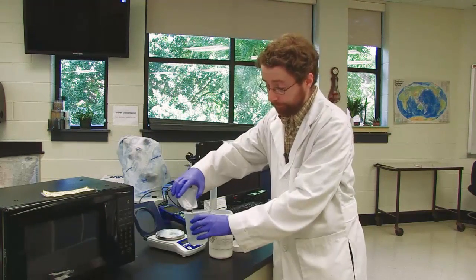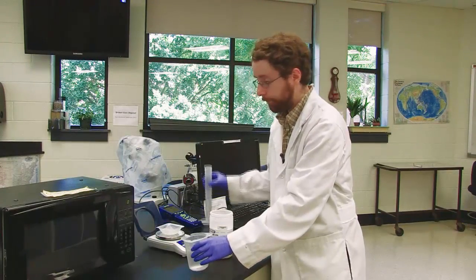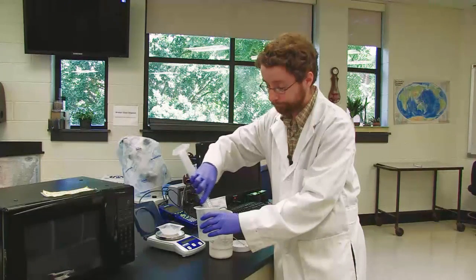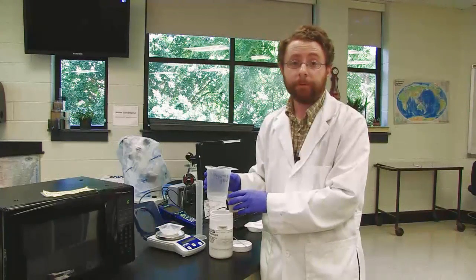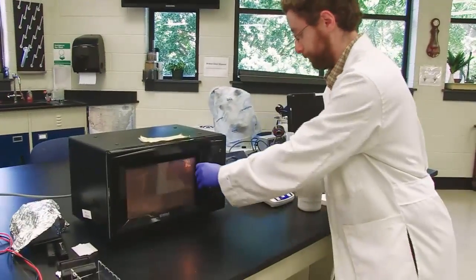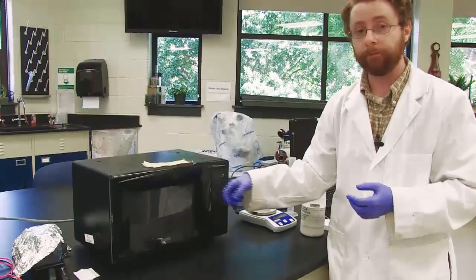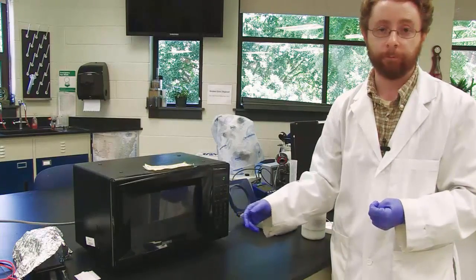I then take my agarose and I will pour it into my container here. And then I have 50 mils of the TAE running buffer. I will add that to my flask. And now I'll put this into the microwave because we need to dissolve the agarose. I'll set it for 1 minute, and then after 30 seconds, I'm going to stop the microwave, take out my container, look to see if the agarose is being dissolved, and then put it back in for a few more seconds.